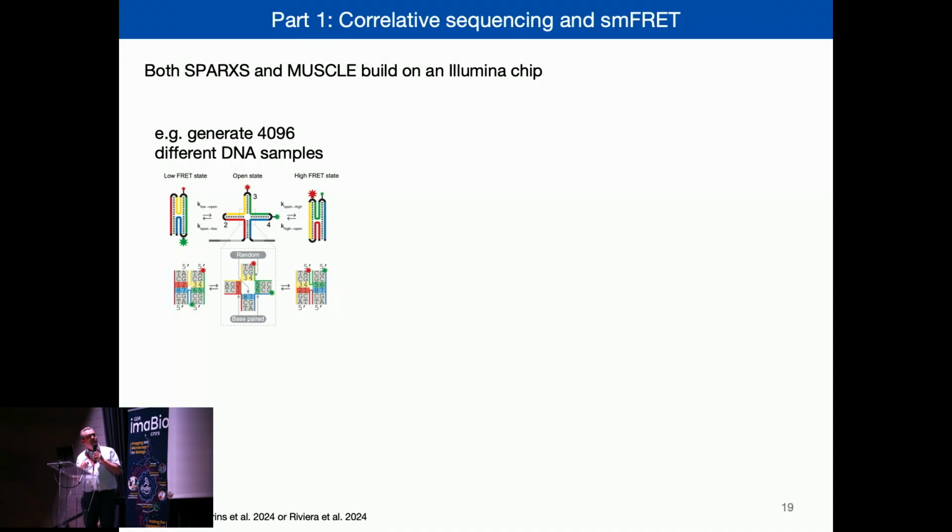So the Tinnefeld lab, in this case, was interested in a DNA sequence called a Holliday junction. That's one of the intermediate elements during DNA recombination. And they were interested in whether all bases or some bases close to that central cruciform-like structure influence the dynamics and the kinetics and the overall population of a low FRET efficiency state or a high FRET efficiency state.